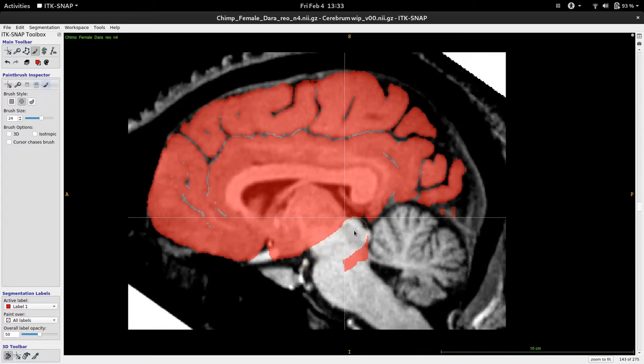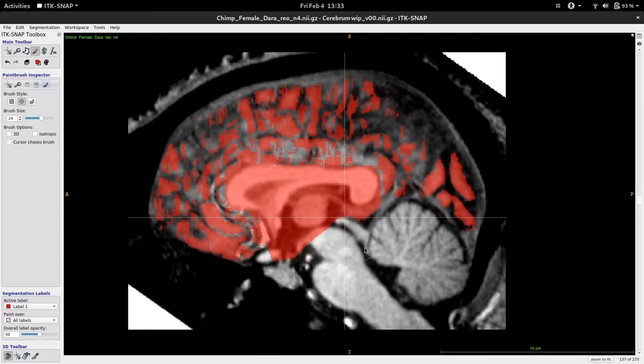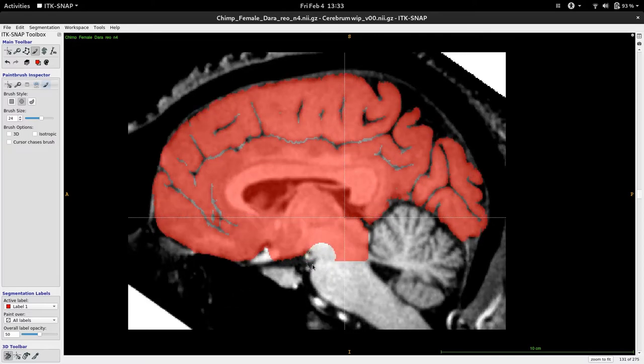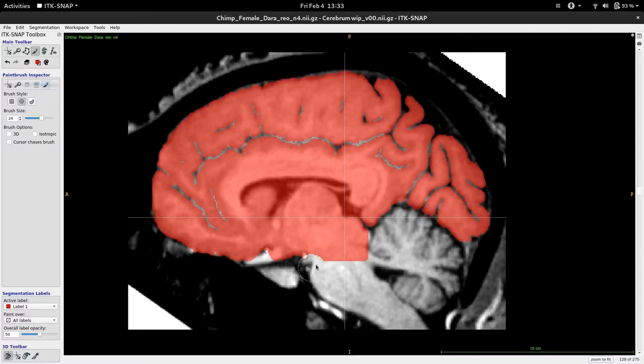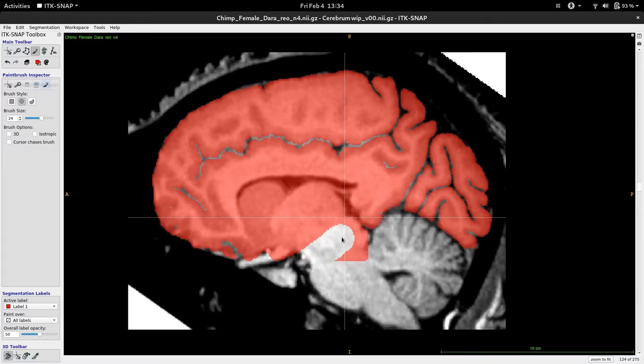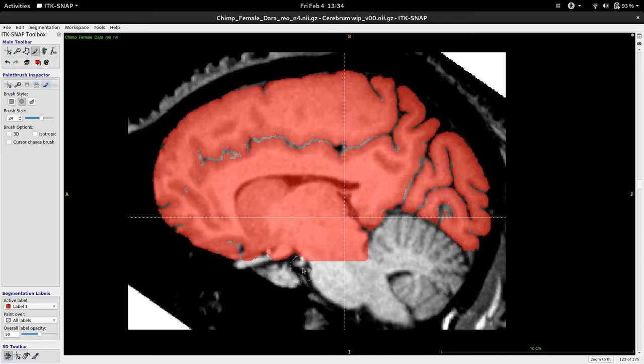Oops. Control, just remove. So I'm not touching the other parts of the brain because this video is only to show how I'm cutting the brainstem when I segment these animal brains, or human brains sometimes, in some principled way.